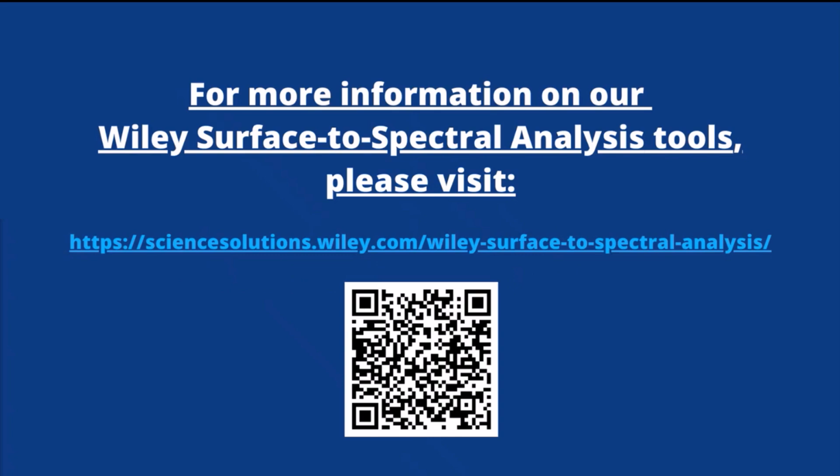Great. Thank you both for those clarifications. Let's see, might have time for one more question. This is a specific question. Can it be used with XPS mapping data from a Thermo instrument? I believe so, as long as you have a file type that is compatible. And to see the list of all of the file types we support, you can go to our website, sciencesolutions.wiley.com, and there is a list of supported file types displayed.